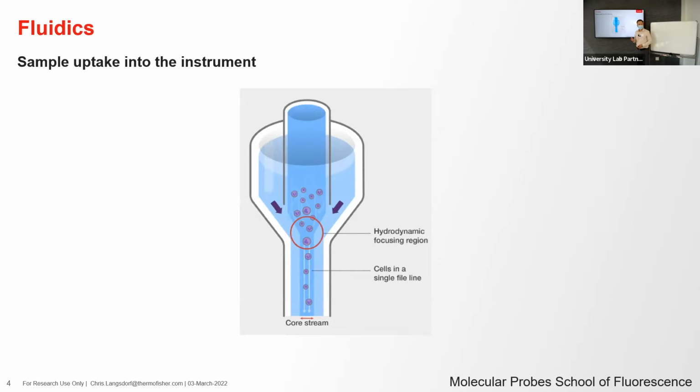The instrument that you have on site has what we call sheath fluid. That is the saline solution that does this squeezing of our sample, but it also has a second focusing component called acoustic focusing. So it actually uses sound waves that are tuned to a certain frequency. The actual ultrasonic sound waves push our cells physically into this line, and that allows the cells in the instrument that you have to go substantially faster than any other instrument can. So essentially, you can get results a lot faster than other instruments are able to.